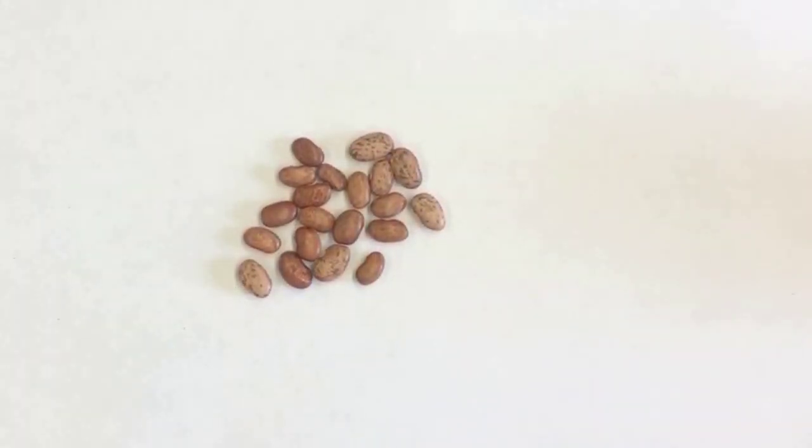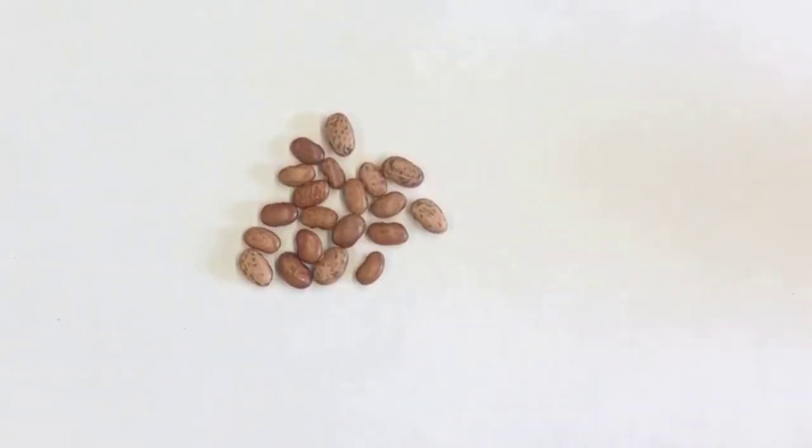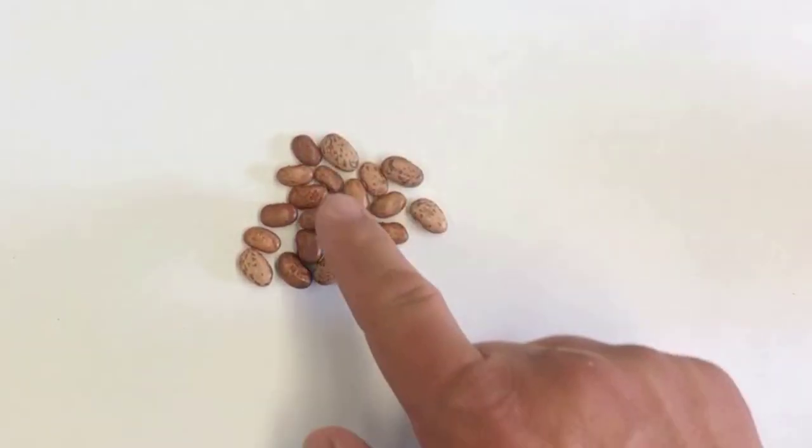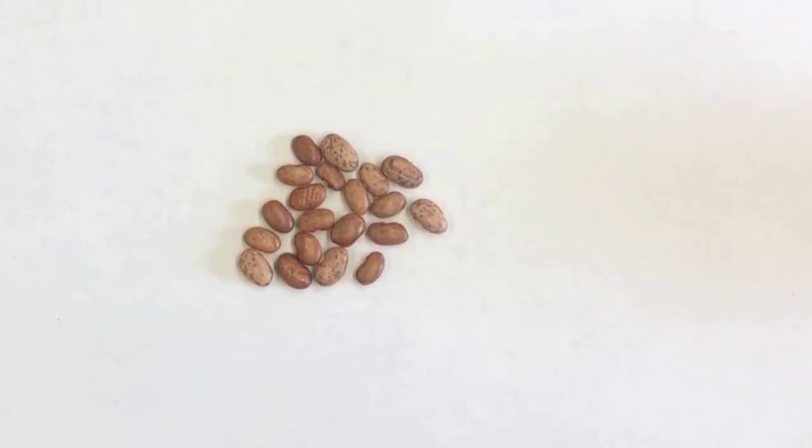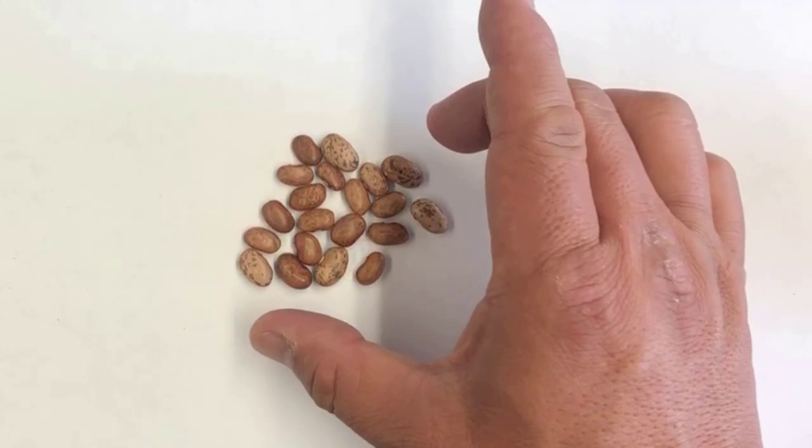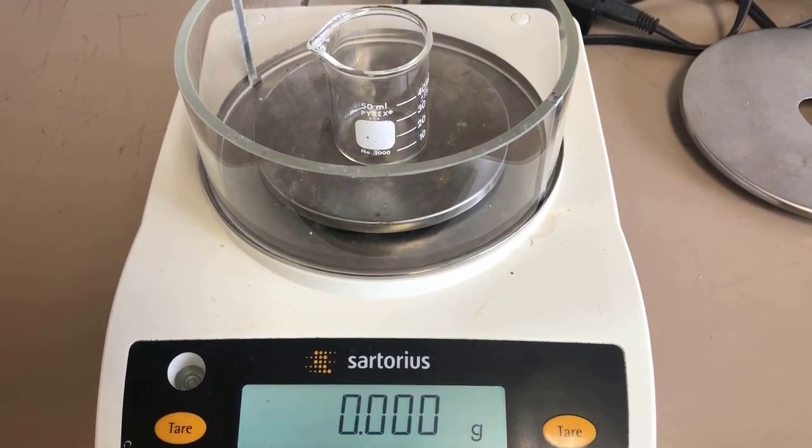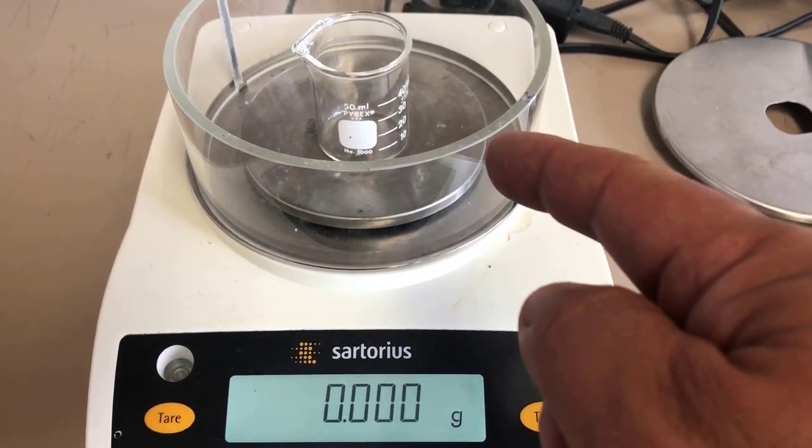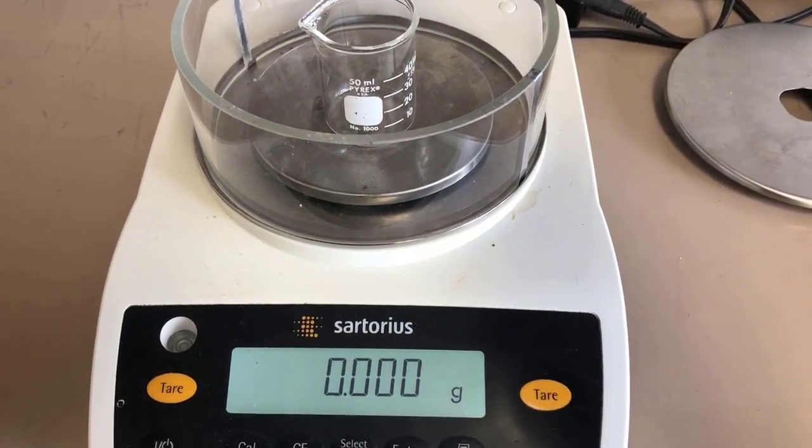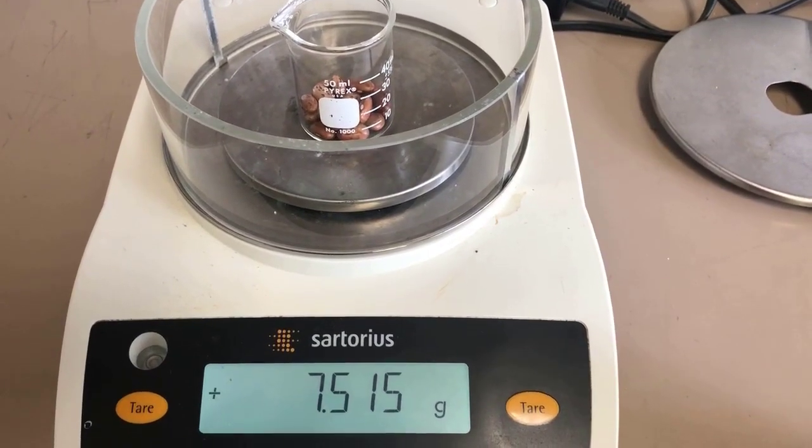We'll calculate the mass of the beans simply by subtracting those numbers. Next what we'll do is we'll take these 20 beans and get their mass on the balance and we'll use that to calculate the mass per bean. You notice that some of the beans are big and some are small, but we have a large enough sample. We should be able to determine a relatively accurate average mass. So to get the mass of the beans, I'll tare out the mass of the beaker and I'll just add the beans to it. And that's the mass of 20 beans.